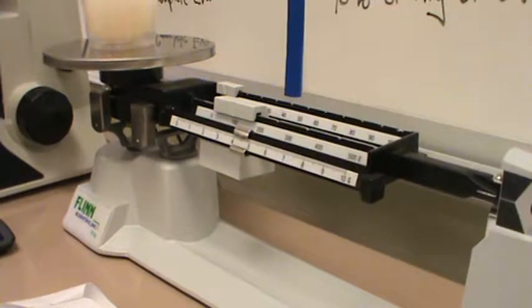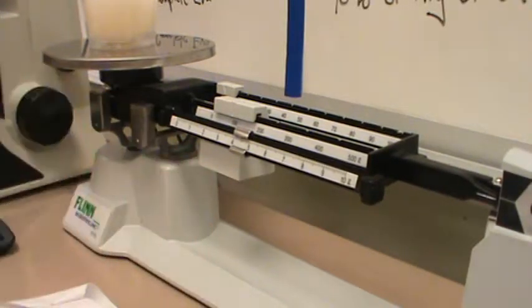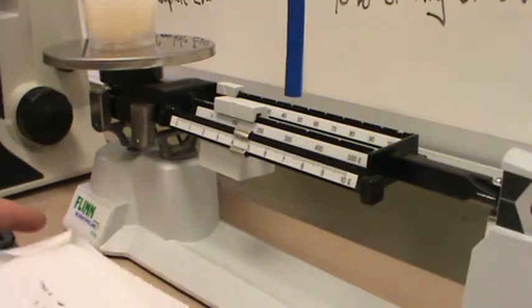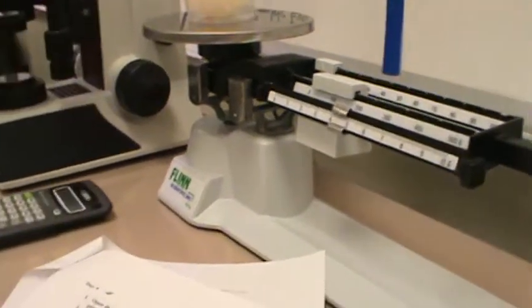I was hypothesizing in class in front of the students that we might see a 1 or 2 gram increase in our mass, but actually we're seeing quite a significant increase in our mass. All right, so let's record some data here.